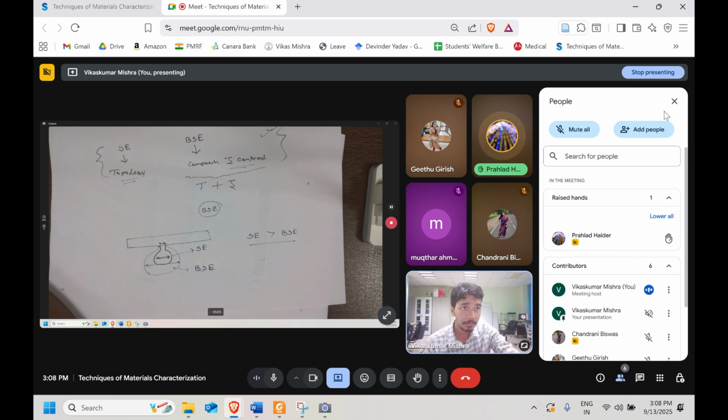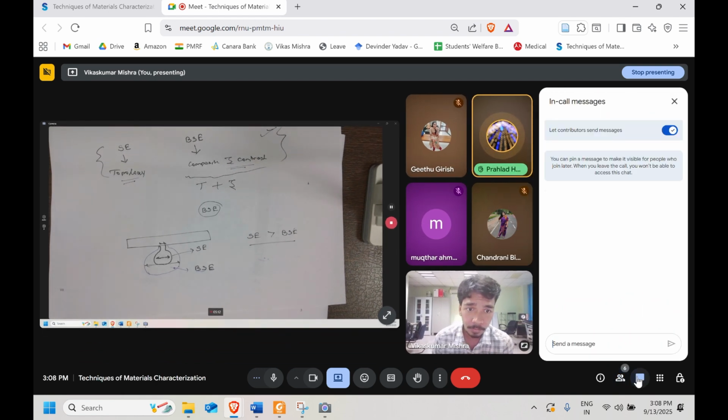As you are explaining this, for fractography, we get the 3D view, correct? Now we use the SE over there, correct? Now, how is SE creating the 3D effect, why can BSE not do that? And why is SE used over there, what are the different advantages of that? You can add this also with this point.